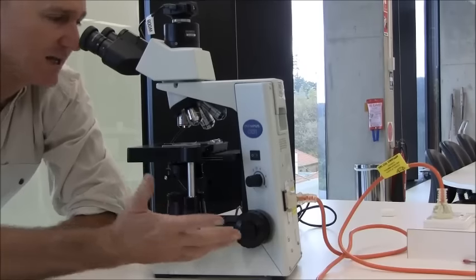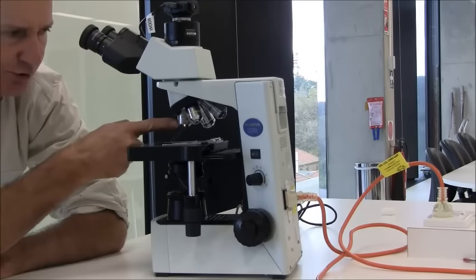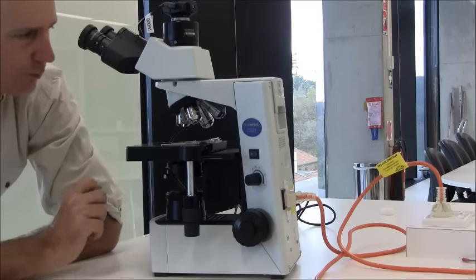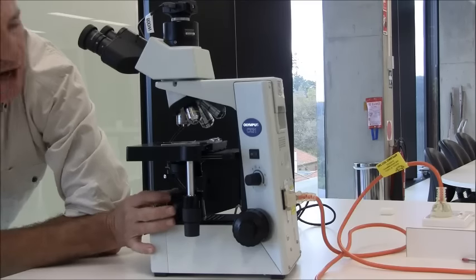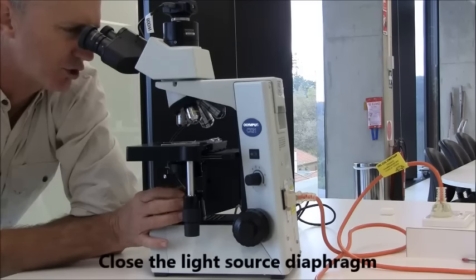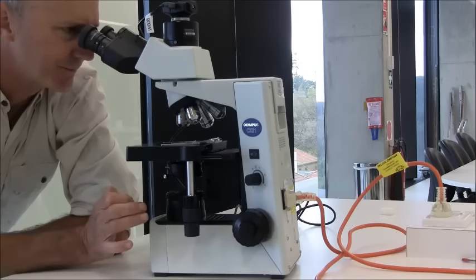You start by getting the sample focused on the low magnification, on the ×4 objective lens. Once you get a reasonable sample focused, you then close this light source diaphragm. And looking down the microscope, you can see this shadow appear. And you can't close it completely. There's a small circle of light in the center.